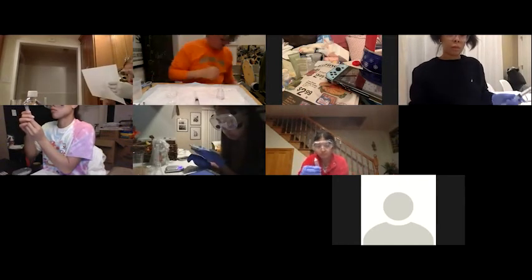So that would be about 9.4 mils. I don't know if you can see that particularly well, but you want the top piece of rubber, not the bottom. So I've got 9.4 mils. So that will be my initial volume.